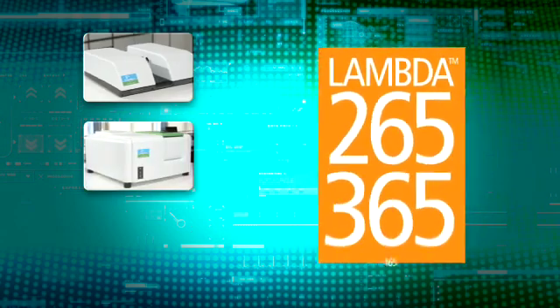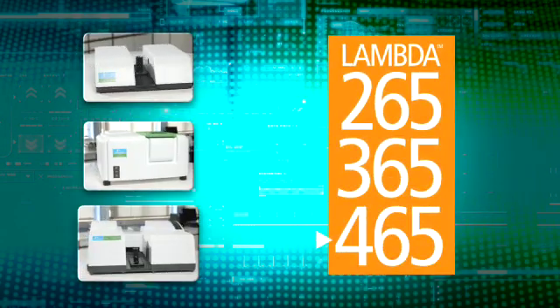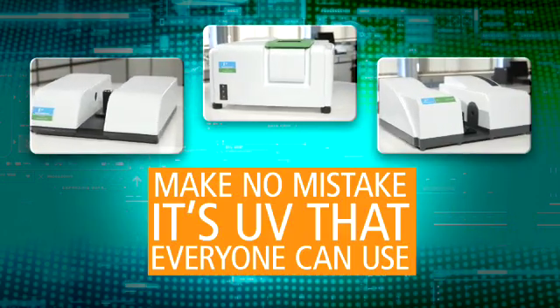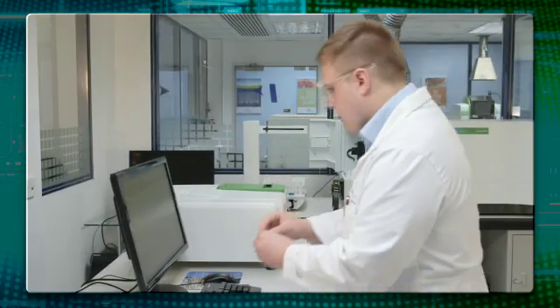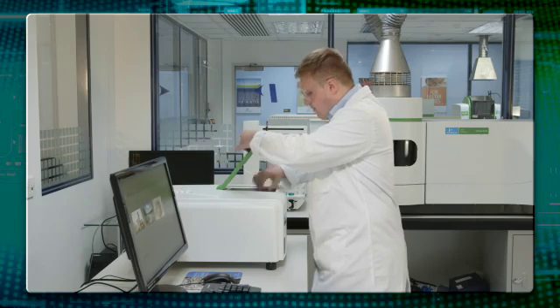PerkinElmer's Lambda UV-Vis family of instrumentation allows scientists to run complex as well as basic analytical experiments quickly and easily, whether they are UV-Vis experts or novice users. If ever there was a time for easy-to-use UV that brings all your operations together, it's now.